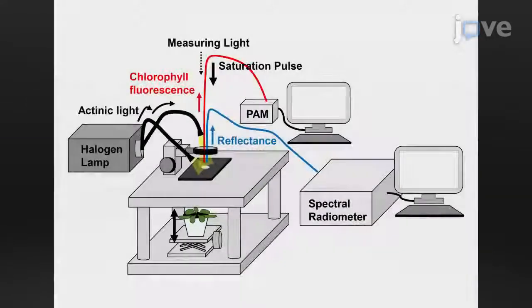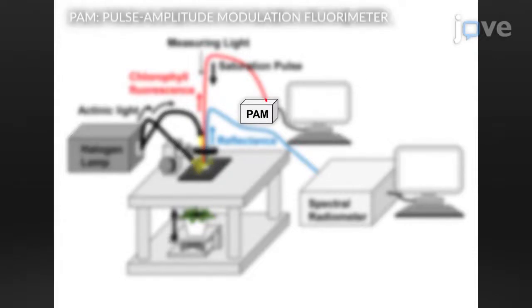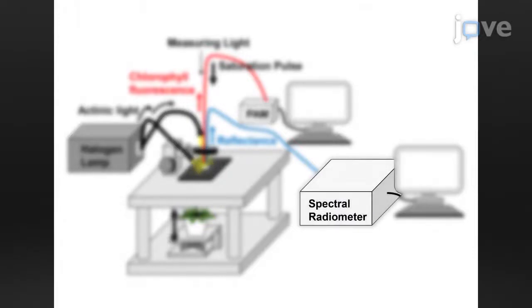Before beginning an experiment, set up a measurement system as shown in the schematic with a sample stage, light source, PAM fluorometer, and spectral radiometer.